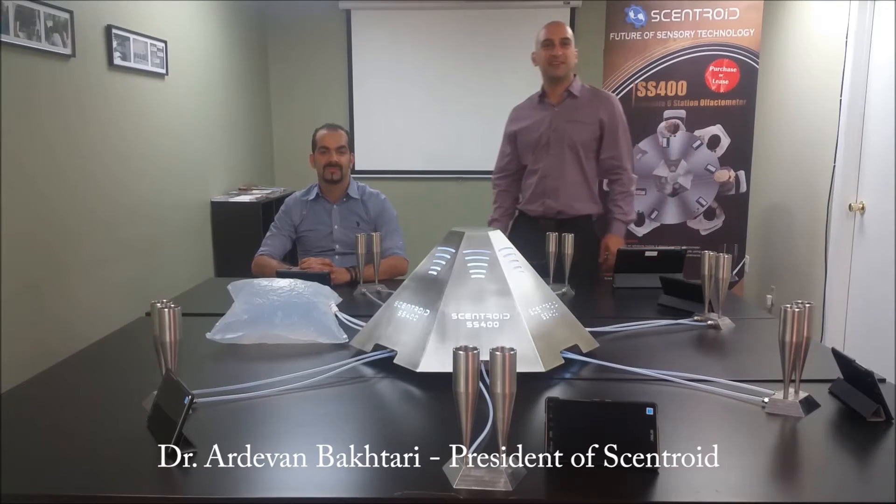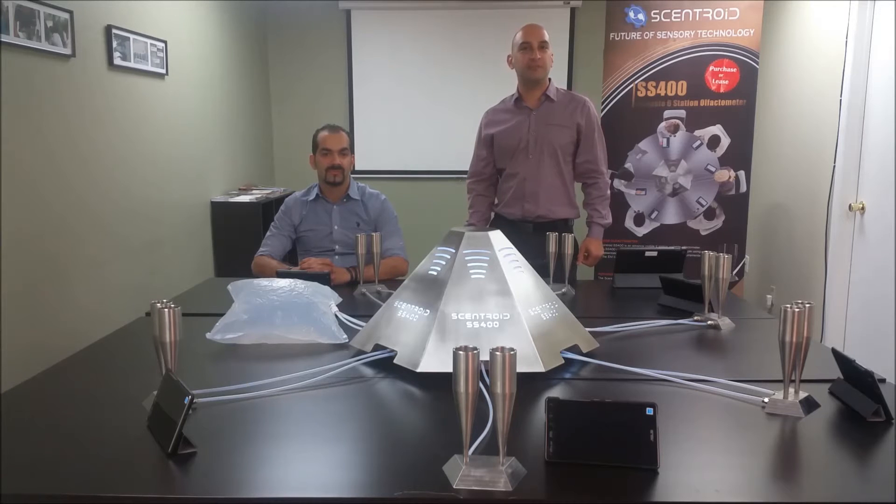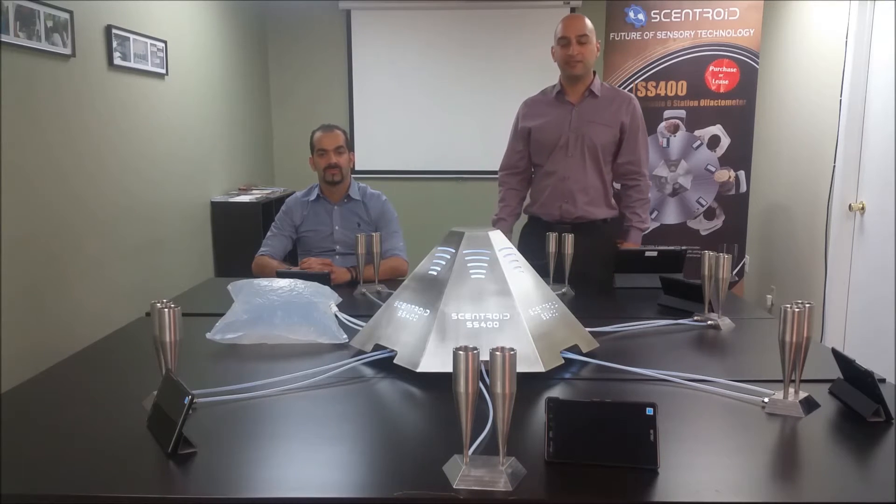Hi, welcome to Scentroid. This is Ardevan Bakhtari and today we're here to bring you another one of our products — a quick look at the SS400 olfactometer.